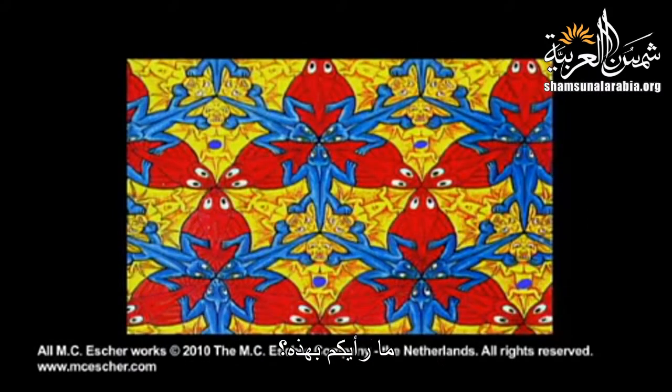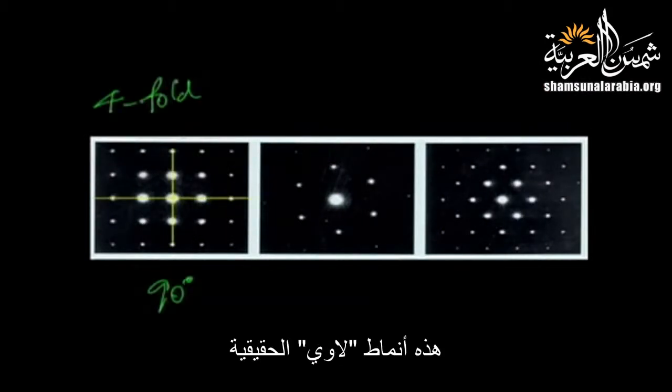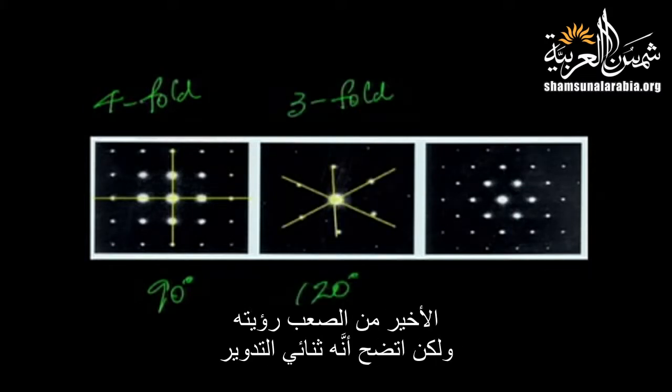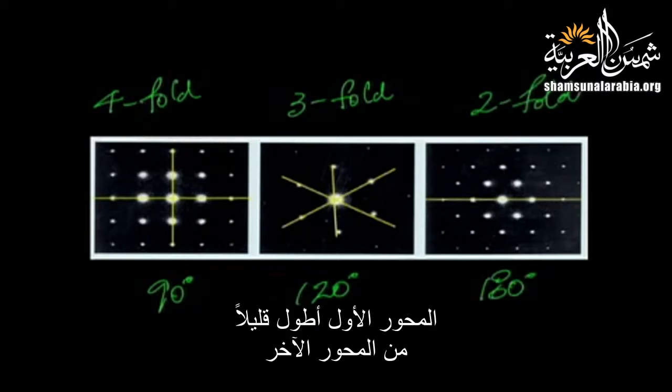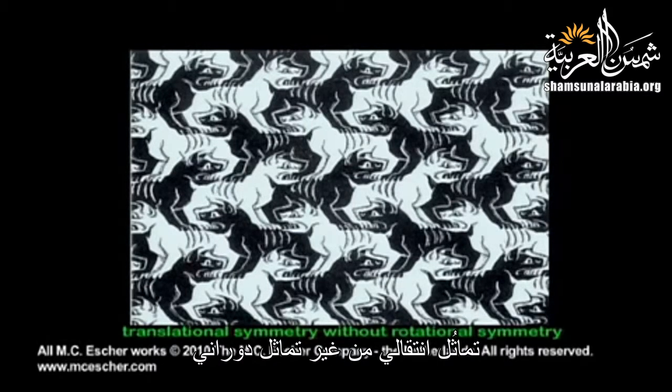All right? How about this one? That's 3. All right. Now, these are real X-ray patterns. This is 4-fold. This is obviously 3-fold. This one's hard to see, but it turns out it's 2-fold. The one axis is just a little bit longer than the other axis. Okay. What about this one? That's our simple cubic puppy. Yes, 1-fold. Translational symmetry without rotational symmetry.